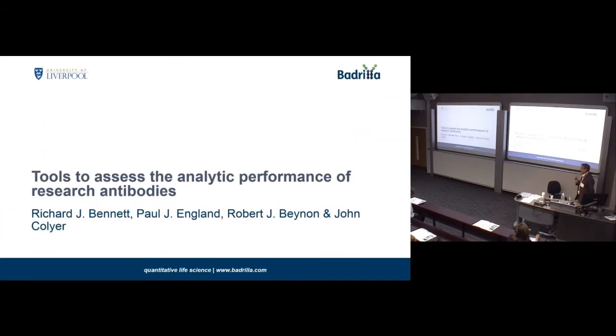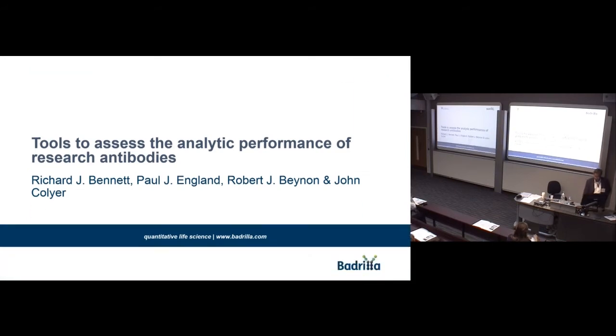So we've been collaborating with a number of university groups in the UK to achieve this. And so I'll introduce you to the tools to look at the analytical performance of your antibody-based test, both as a manufacturer perhaps, and certainly as an end user. The people who've done the work are largely a mass spectrometry team led by Rob Beynon in Liverpool and a CASE PhD student between the company and Liverpool, Richard Bennett.